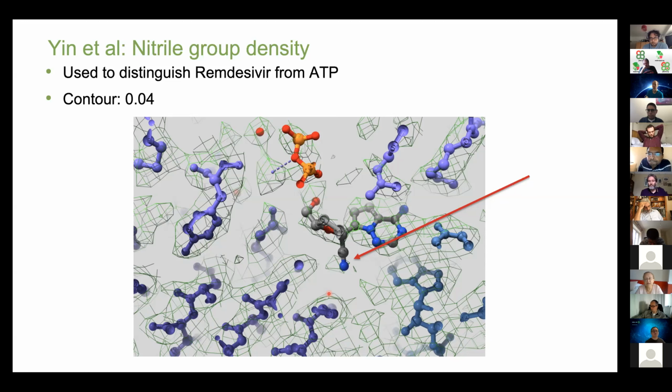It's related very much to the occupancy. It's very much related to stability, and if you like, temperature factor, and it's really very much affected by over-sharpening. The map is definitely over-sharpened. But if we have uneven distribution of angles, which come naturally from the images, because particles very often have preferred orientation in water, then comparison between two halves does not reveal any issues related exclusively to the incomplete, not even distribution of angles in the Euler sphere.